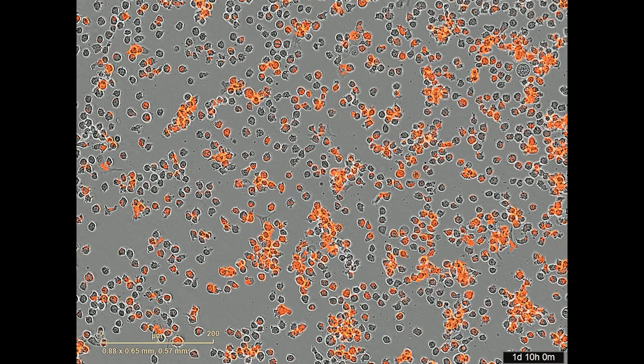This phagocytosis assay is a common experiment that is run in pharmaceutical research to observe the impact of new antibodies or novel chemical modulators on the phagocytic response of cells. Feel free to share your thoughts or ask questions in the comment section below.